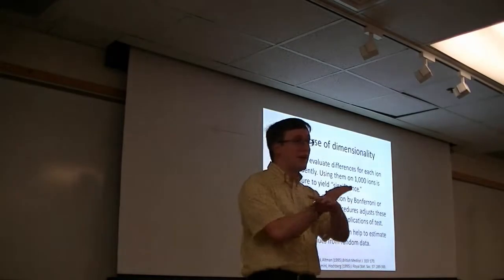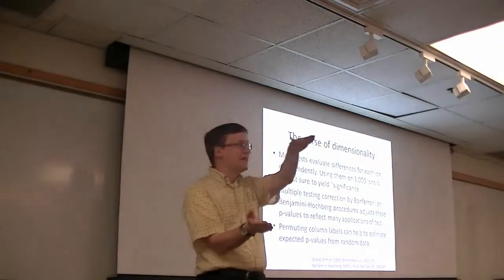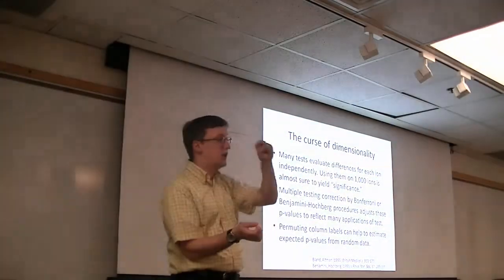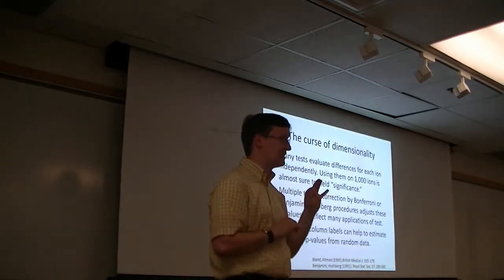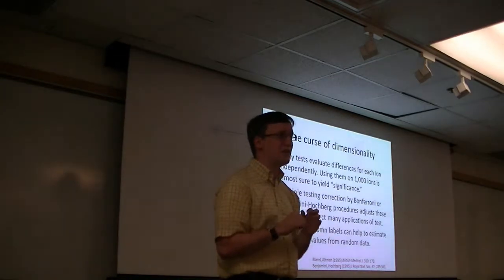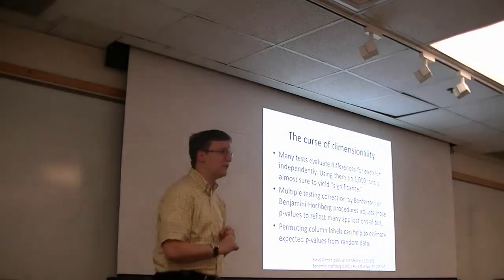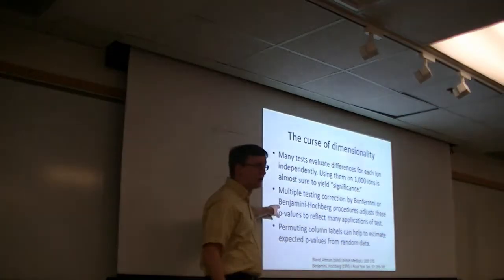So when you're looking at a Manhattan plot from a GWAS, from a genome-wide association study, you'll frequently see a line drawn across that represents the Bonferroni corrected p-value threshold. So Bonferroni is strict, and that is a really, really hard criterion to beat. Certainly having lots of replicates and very low variability matters a lot in trying to beat a Bonferroni corrected p-value test. The next route is the Benjamini-Hochberg approach.